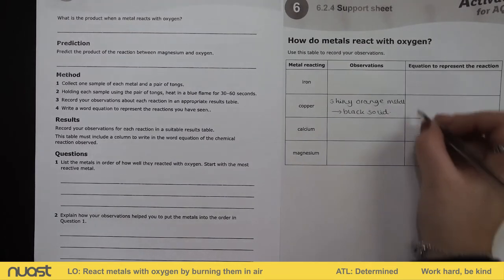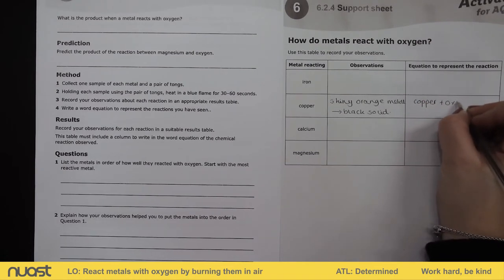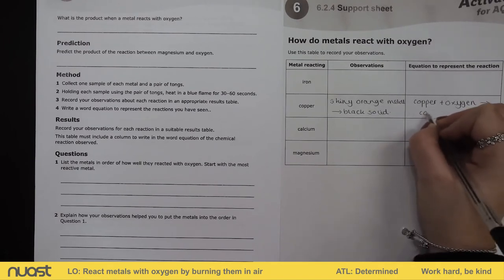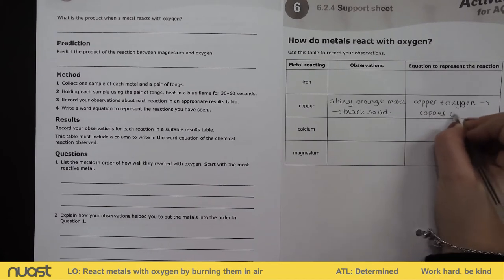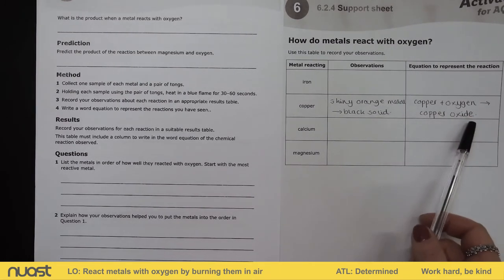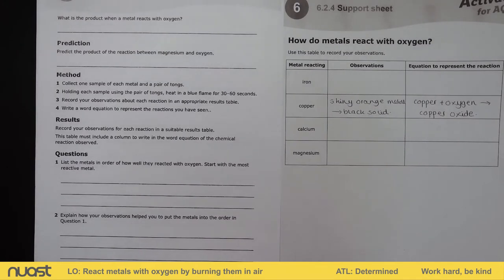Okay, so let's go through it together. So we've reacted copper with oxygen, which is, remember, in our air, in our lab. And what we're going to have formed is our solid copper oxide. Okay, our copper oxide. And copper oxide has this characteristic black colour. So that's what was coating our shiny orange metal.